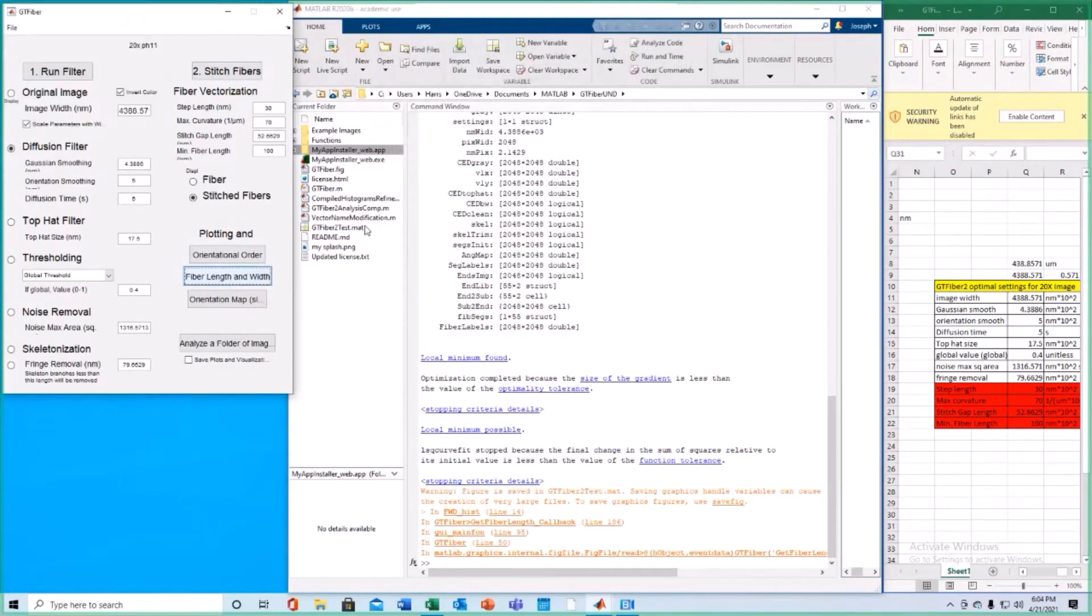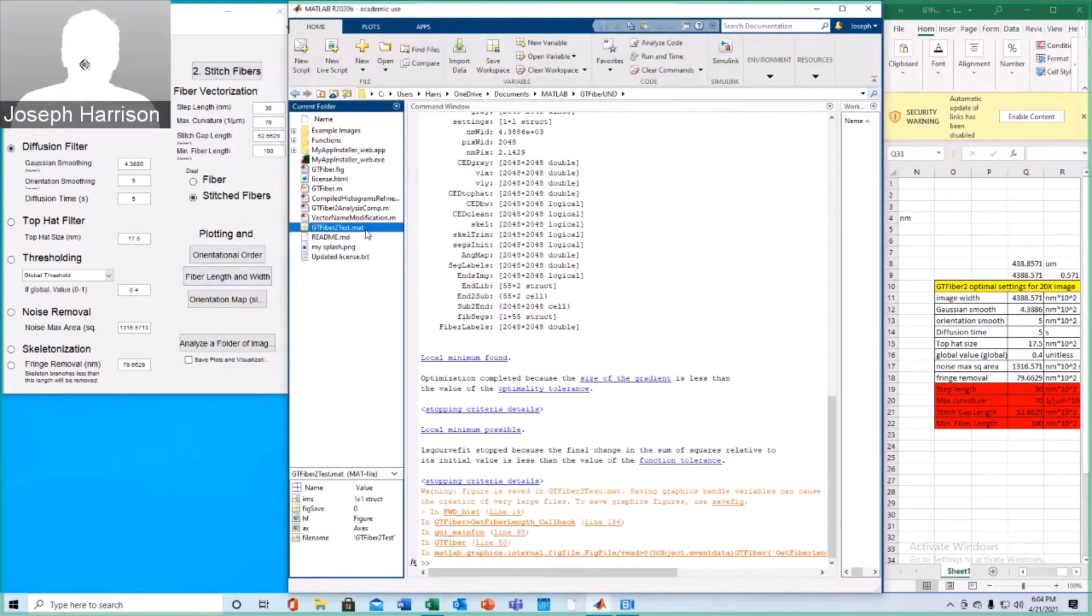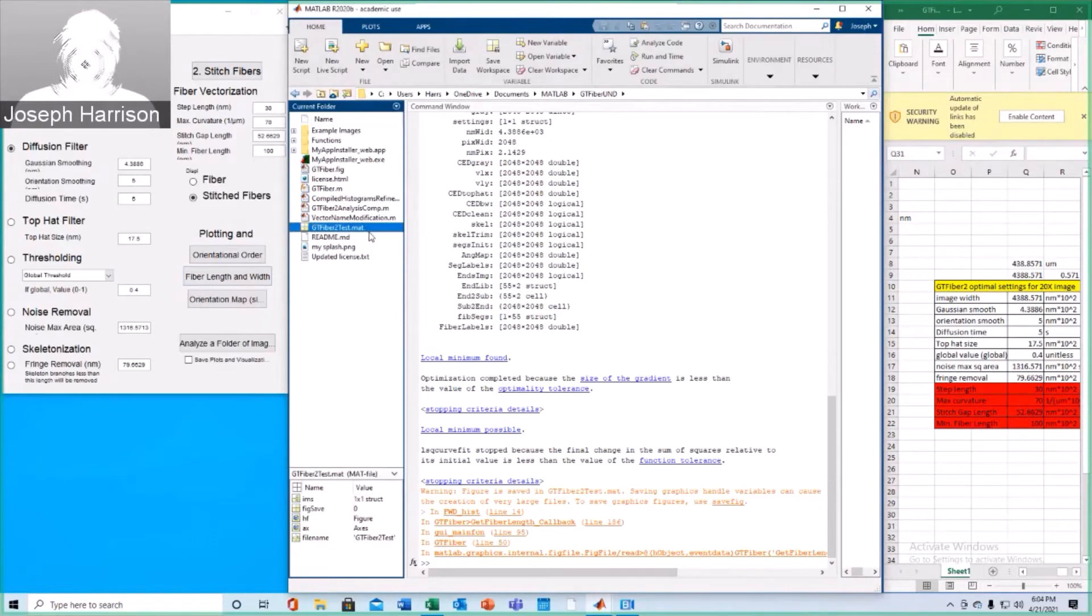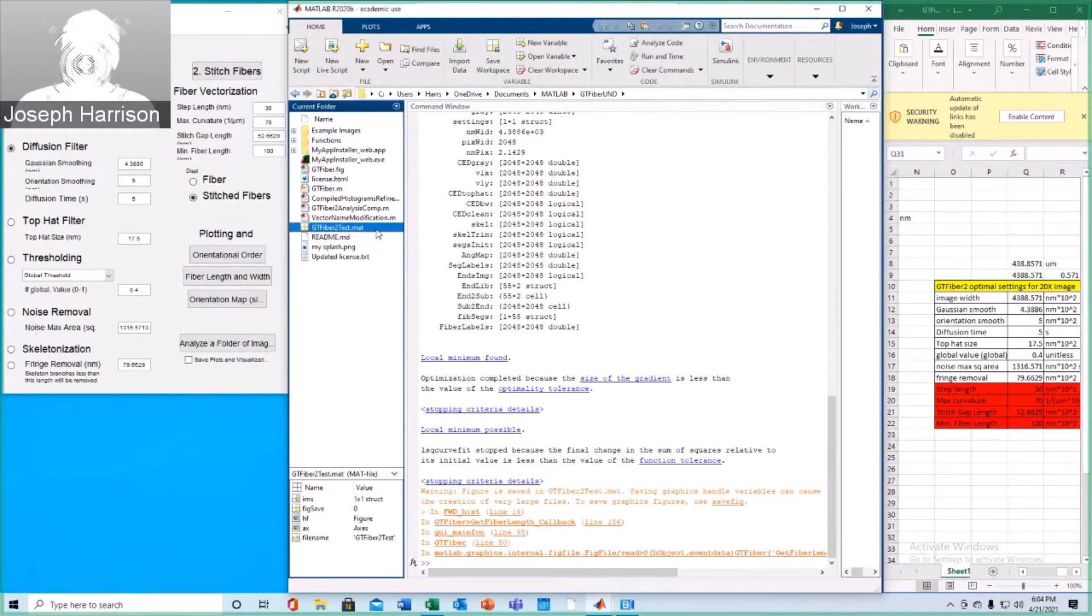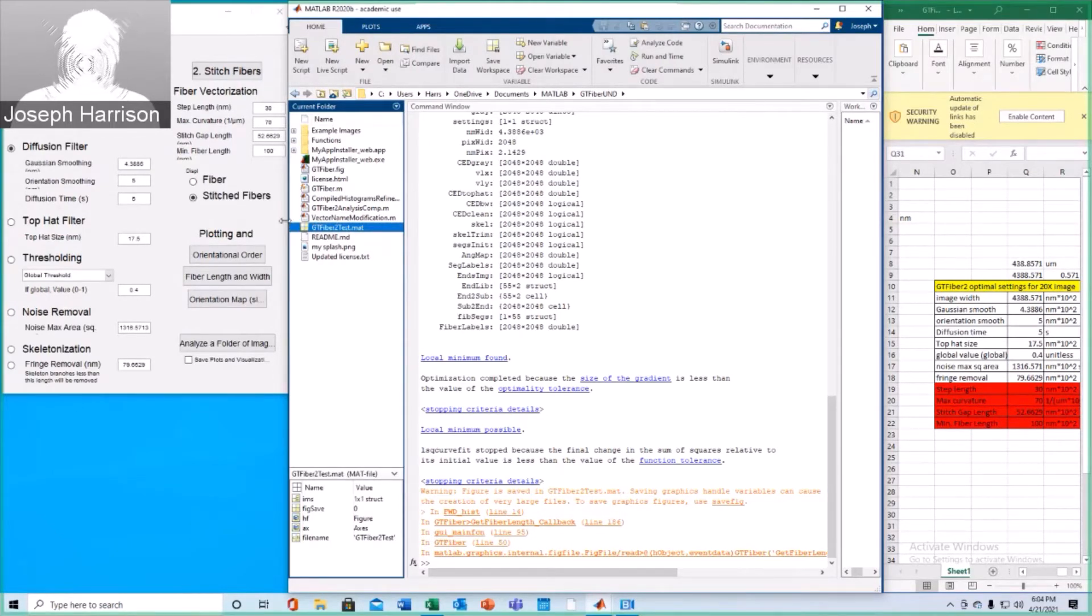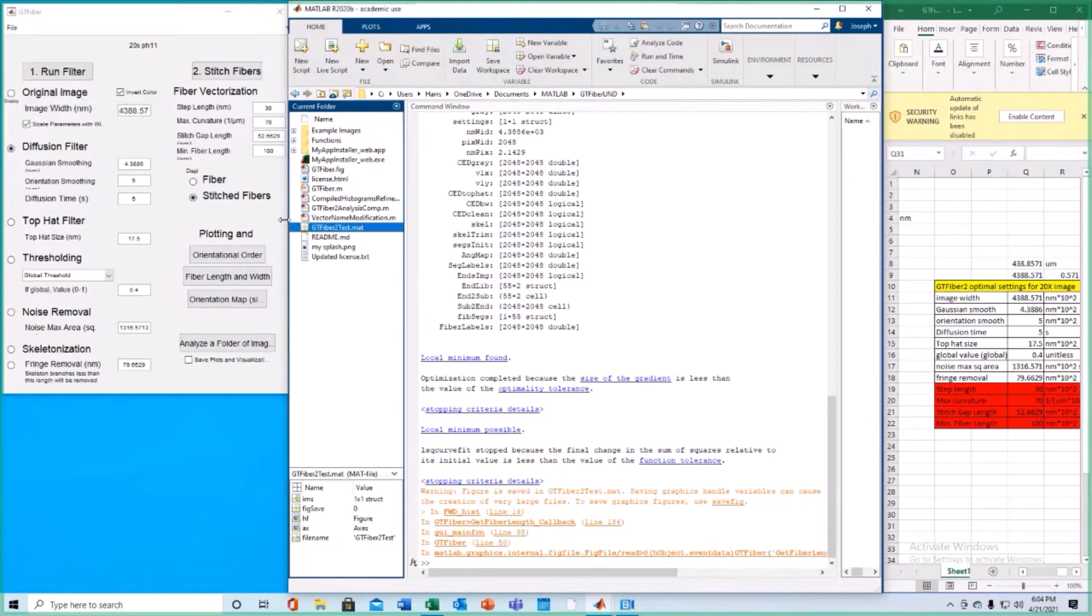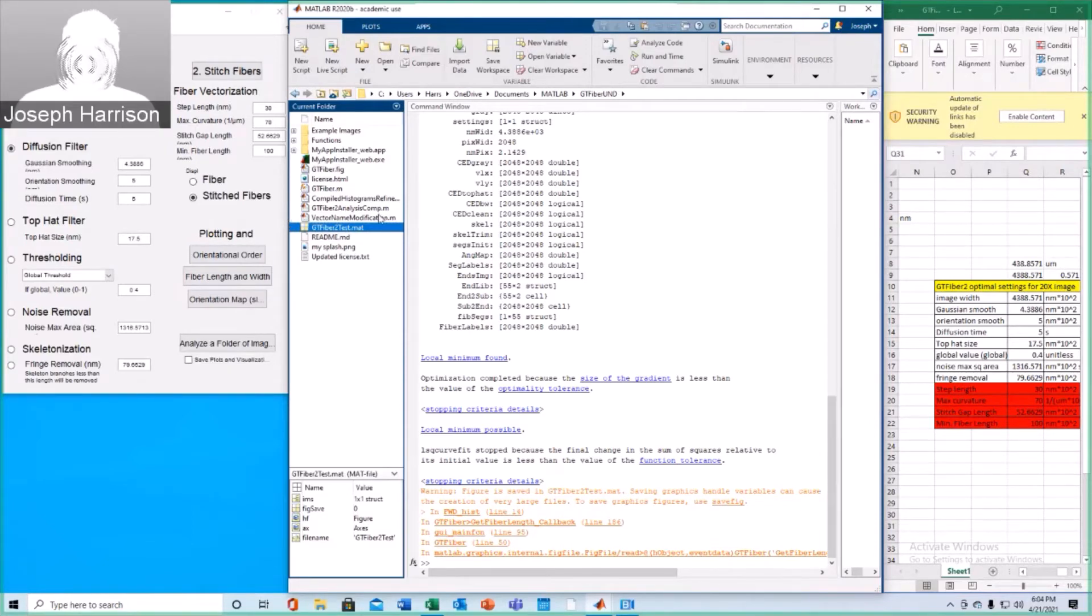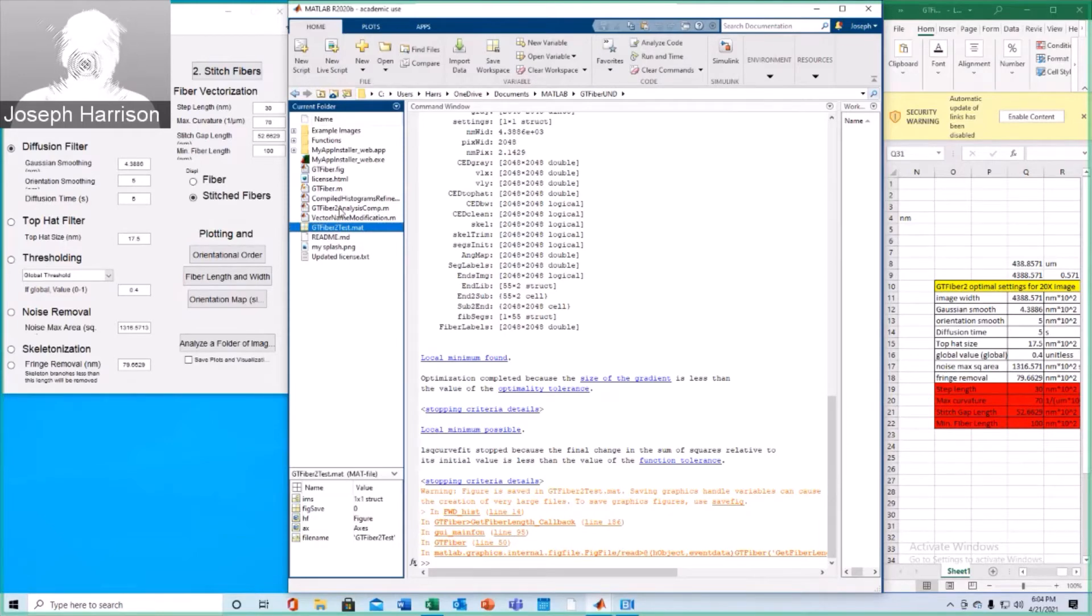As you can see, this gtfiber2test.mat file was saved. This is sort of just a figure that we're using, or structure rather, that we're using in order to contain this data. Alright, so now that that is complete, we are going to open the gtfiber2 analysis comp script.